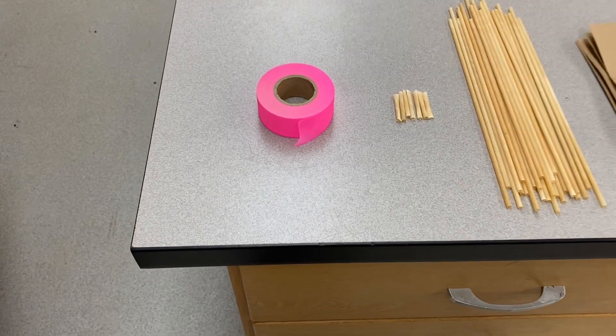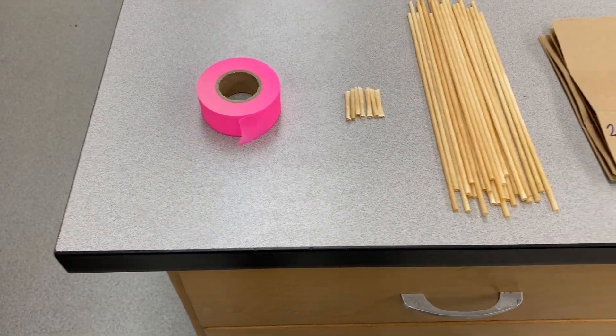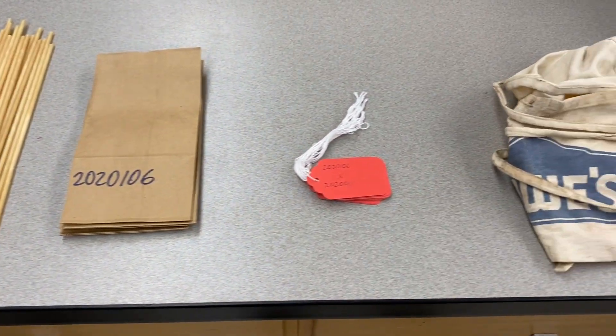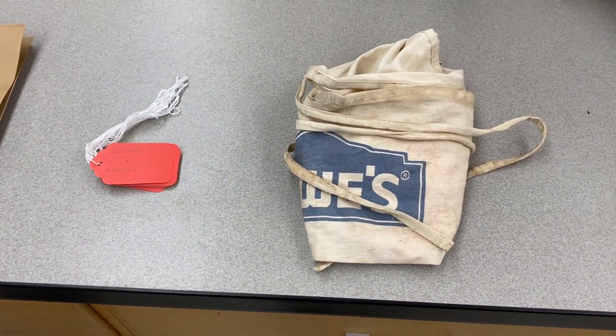For the crossing process, there are a few materials that are required. These items include bright colored ribbon, paper straws, paper bags, tags, and an apron for carrying the supplies.